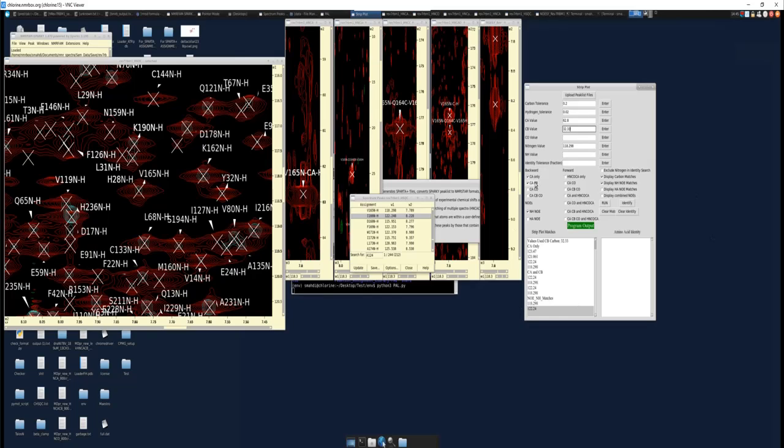So this can be, I think, a powerful tool for combining your HNCO, HNCACOs with your NOESYs and your C alphas and your C betas. So instead of Sparky, where you can only search one triple resonance experiment at a time, this strip plot allows you to search multiple.